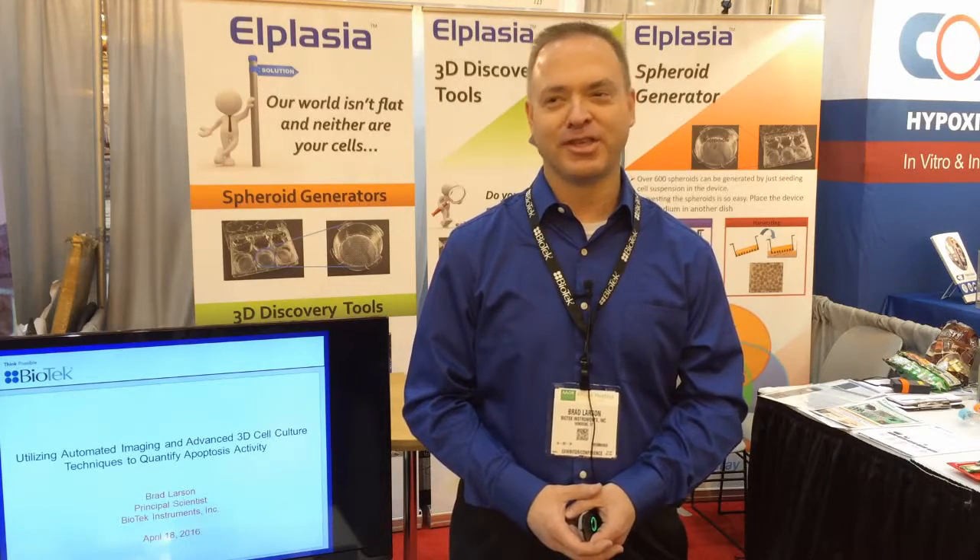The goal of the project was to demonstrate how the 3D spheroid plate technology could be combined with the imaging capabilities at Biotech Instruments using our Citation V — to demonstrate how you could perform a project looking at monitoring induction of apoptotic activity in the cell models, with cells aggregated into 3D spheroids and imaged with the Citation.